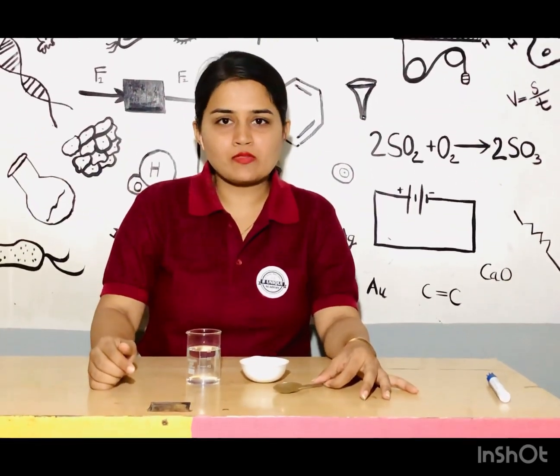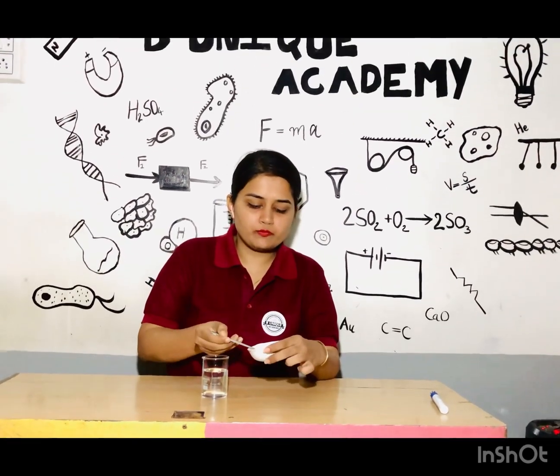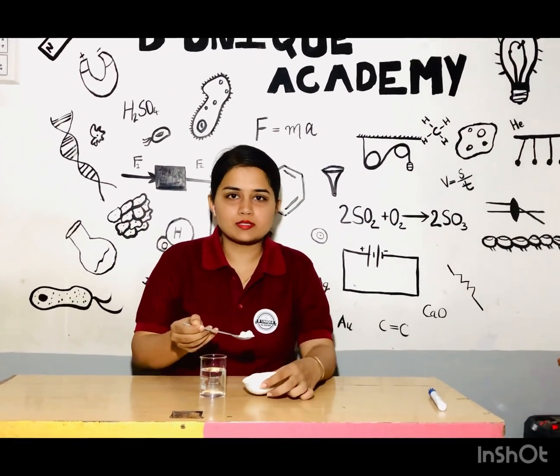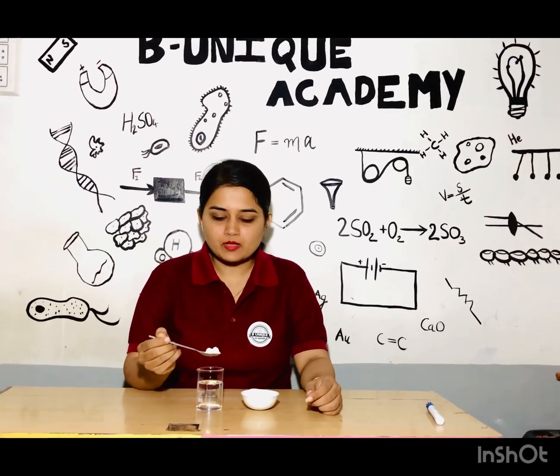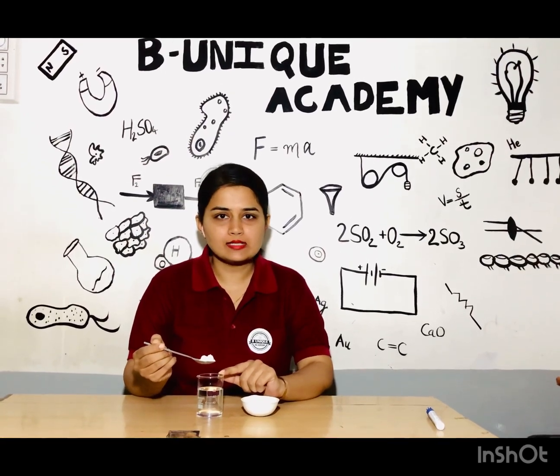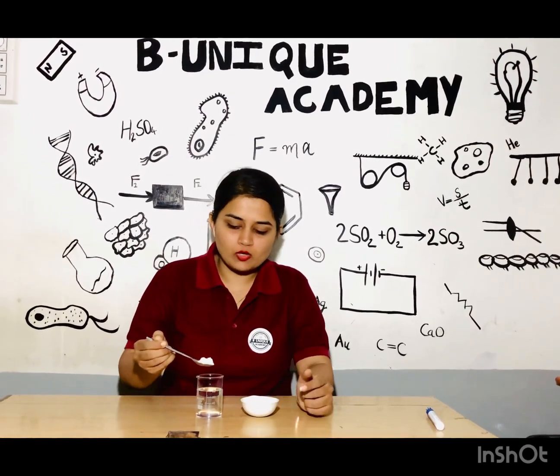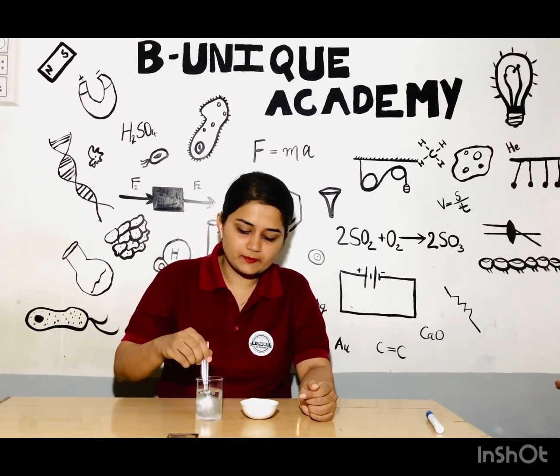The procedure for the activity is, I am going to take 1 spoonful of salt. These salt particles are solid. We know that the beaker is filled with water and water particles are liquid. This salt is going to get dissolved in the water, as you can see.